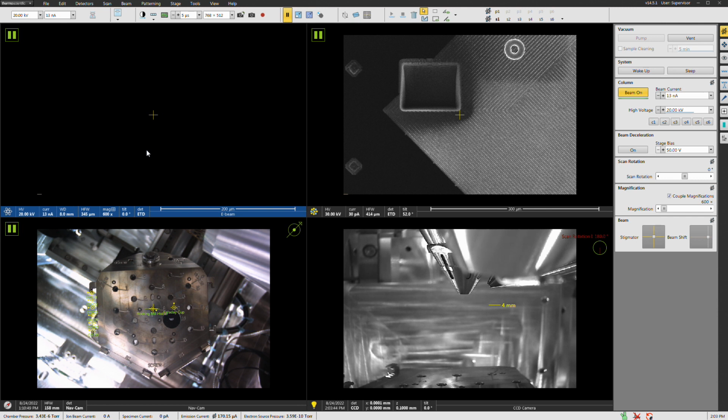The catch to that, though, is that the camera tends to respond more poorly when the electrons are lower energy. So that means your patterns are going to be harder for the software to analyze and to solve. So there's trade-offs here, right?